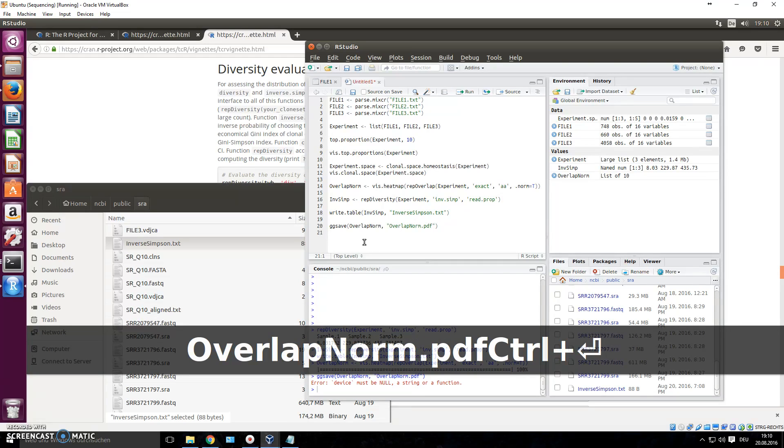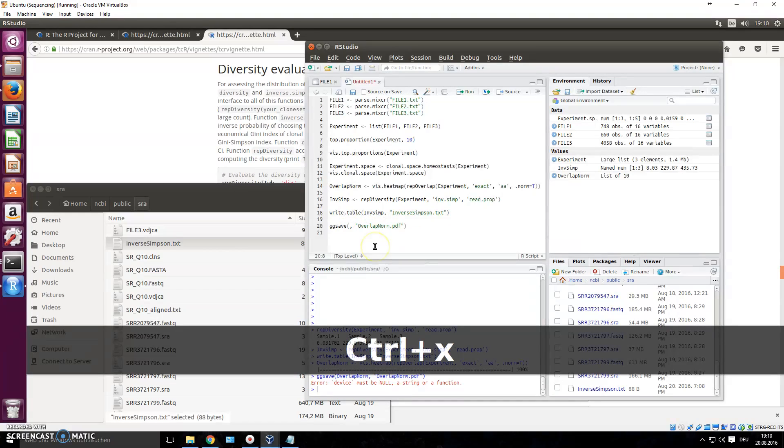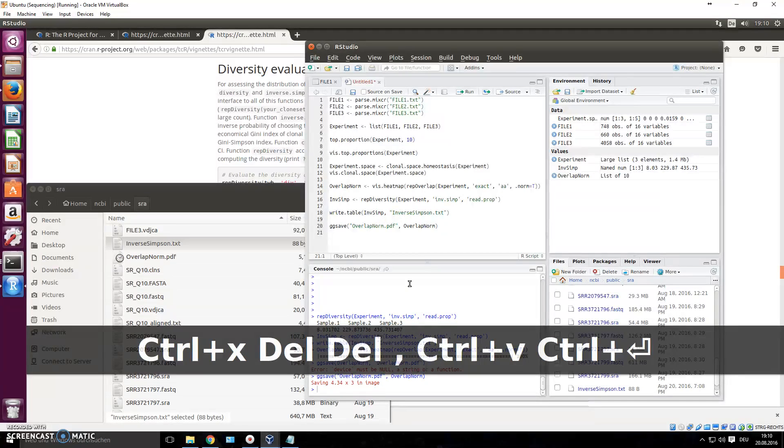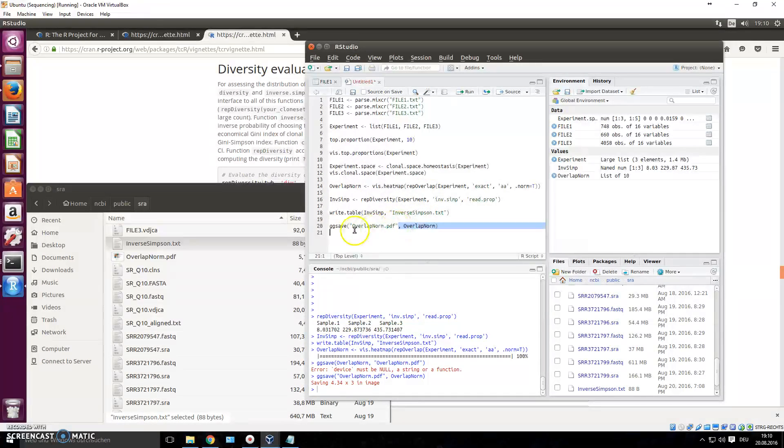Okay, I think it might be that in this command, it just has to be the other way around, and you name the name first, and then this. Yeah, that was it. Okay, so in this case, ggsave is just other way around, you have to name your file first, and then you give the object that it's saved on. And now it's saved the PDF.